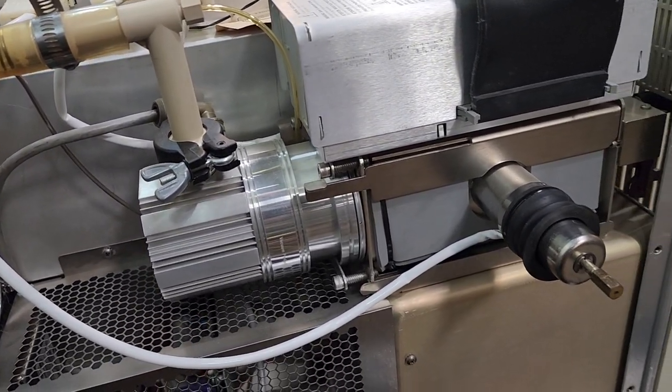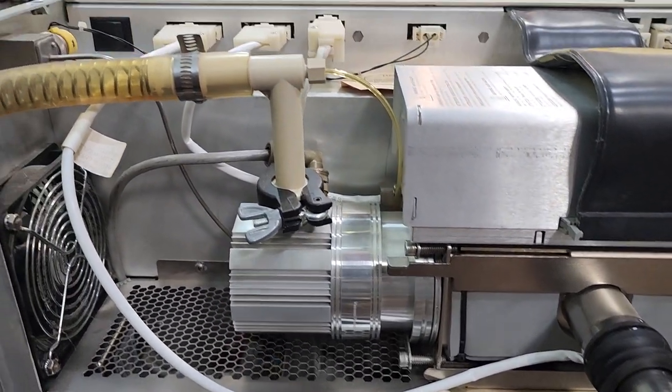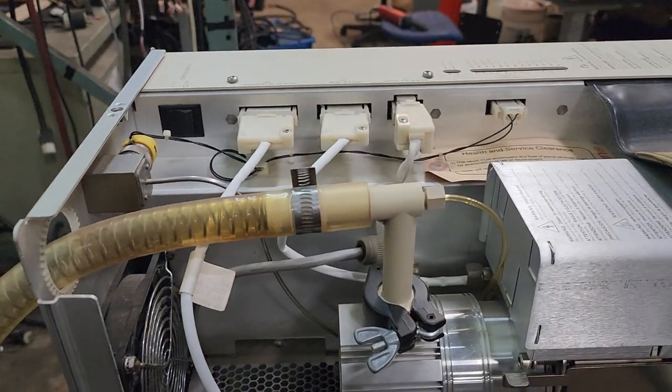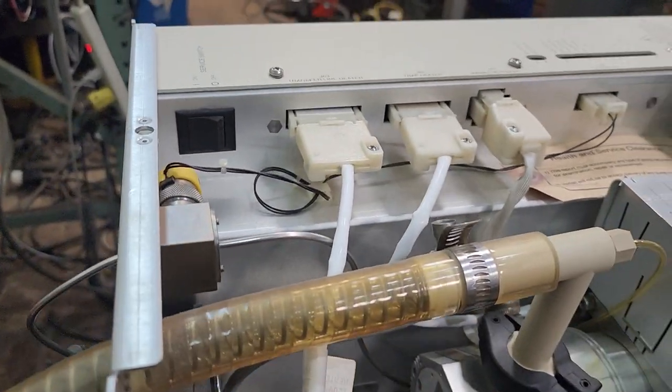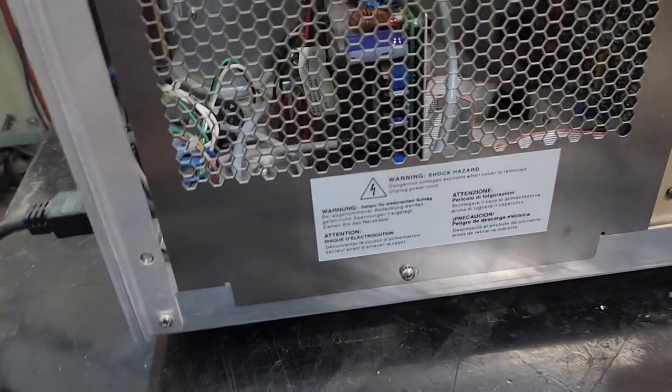I see a lot of people that are just selling this piece for around $700. I'm going to sell the whole thing — it comes with all this stuff. If you want just this, let me know, I'm happy to separate anything out. But it's going to be the price of what we're asking.